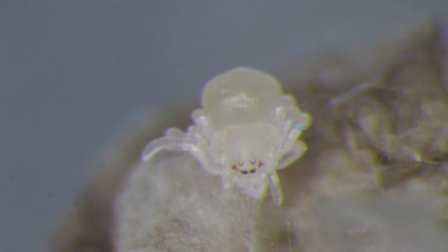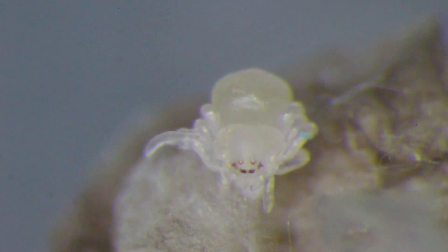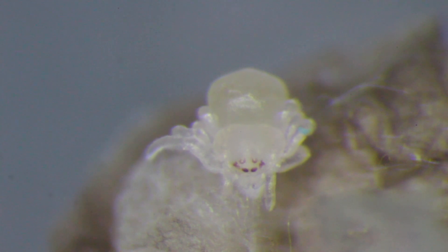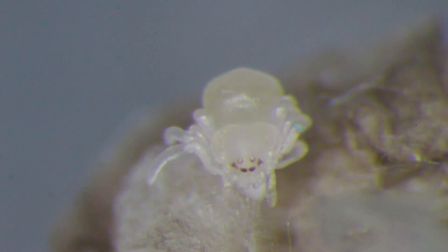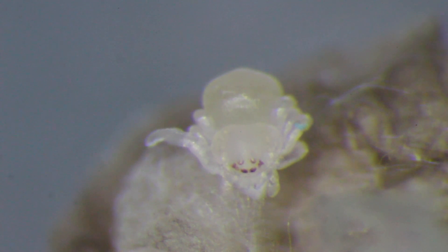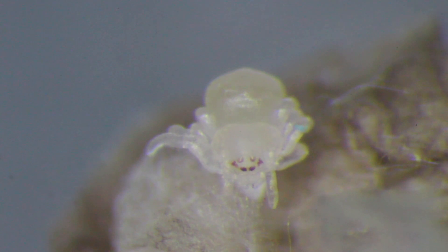I started my career working with fruit flies. And this is the kind of thing I would do all day with Drosophila, as we were interested in how they formed wings and legs. I would just pull the pupae out of their little chrysalis, put them on the scope, do things like label nerves. This is the kind of thing that's going on right here.